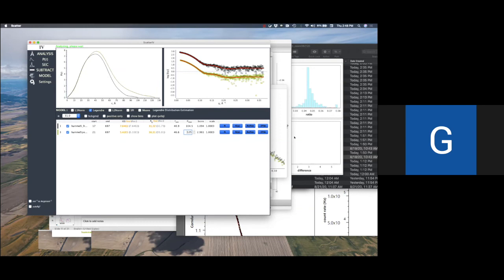And that's different from the standard singular value decomposition, where there's no transition, you're not taking the elution time into account. You're just feeding it all the scattering data all at once, and it's just saying that there are so many basis sets that explain everything. So EFA is using the structure of the data, that you're going to have something coming in to begin with, then that's going to decrease, and something new popping in and increasing and then decreasing again. So that's one major difference.